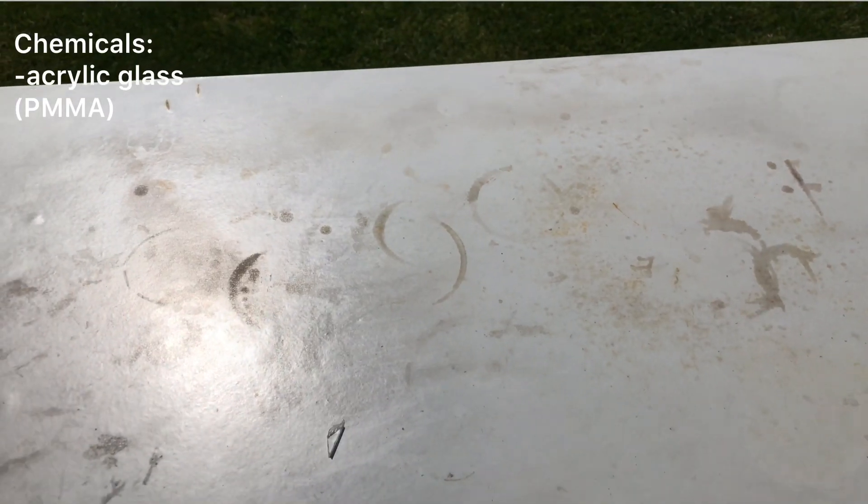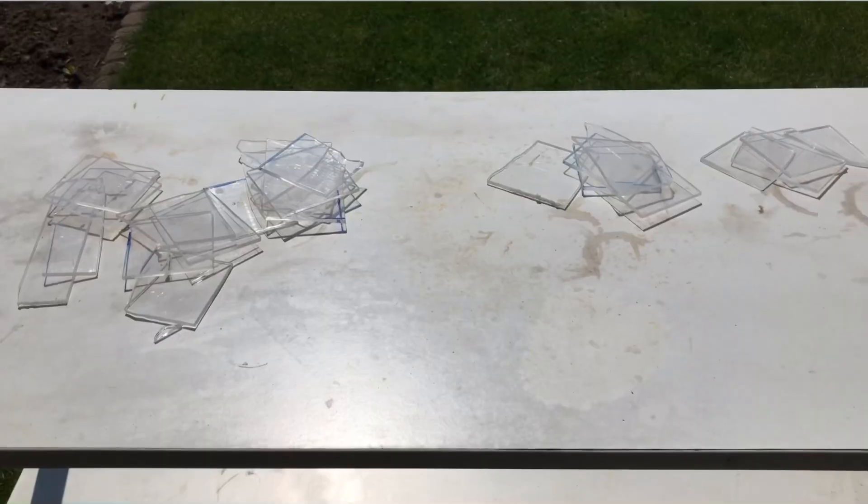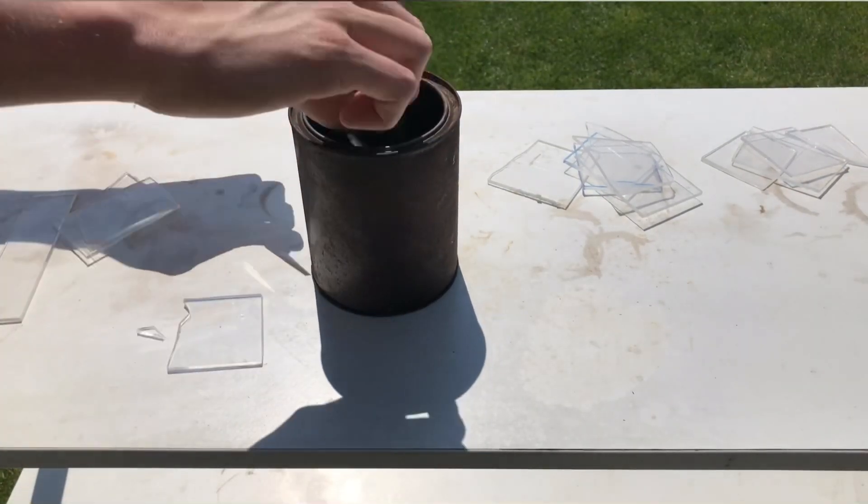If we can even call this a chemical, only this is needed to make acrylic glass. Acrylic glass is made from polymethyl methacrylate and therefore it is the polymer of what we are trying to make.